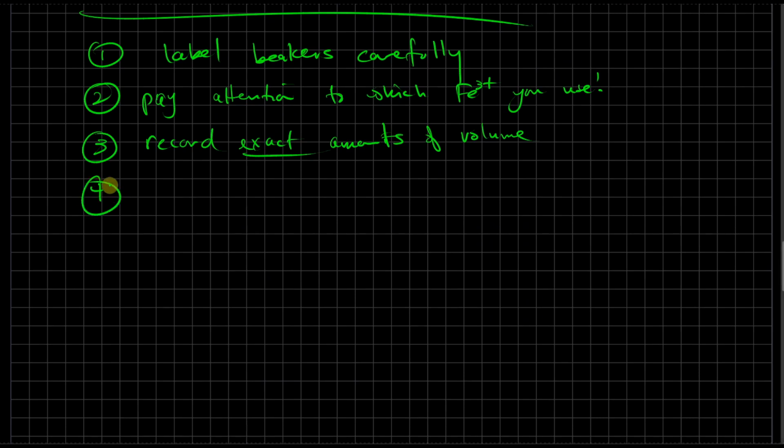The fourth thing that I want you to pay attention to is this is an equilibrium lab, right? Unlike our previous labs where it was kinetics based, and so speed was important because you had to get the initial rate of the reaction before those rates change. For equilibrium, we're waiting until the reaction comes to an equilibrium. So you need to wait, right? This is a patience game. Wait until some time has passed before running your samples, right? You want to make sure it comes to an equilibrium first before you go measure it in a SpectraVis.